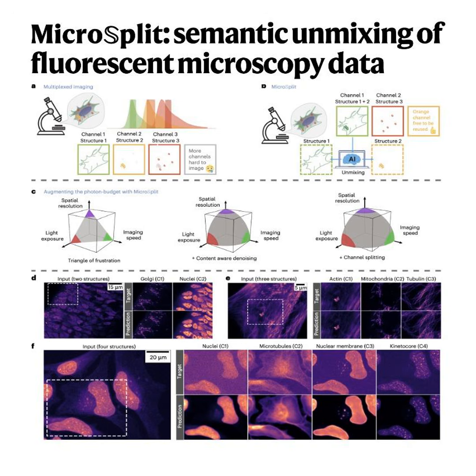And because it's so surgically precise at isolating these learned structures, the researchers realized it actually had a bonus application. The artifact eraser. Yes. They found they could use it as an intelligent eraser for imaging artifacts, like if your sample is polluted with spurious fluorescent puncta, just glowing background trash, you can actually train MicroSplit to treat that specific artifact as a valid target structure. Right, it unmixes the visual trash into its own isolated channel, and then you simply delete that channel, leaving your actual biological data perfectly pristine. It literally turns a frustrating biological bug into an algorithmic feature.